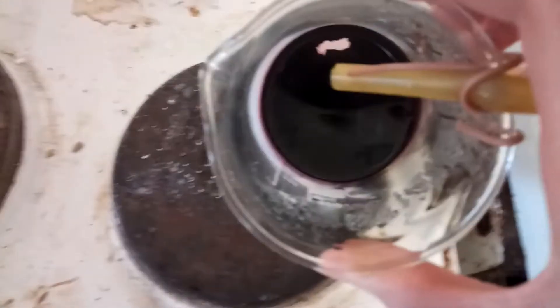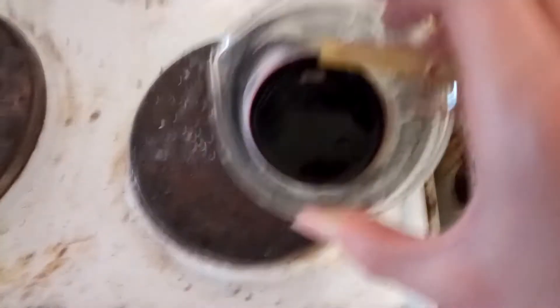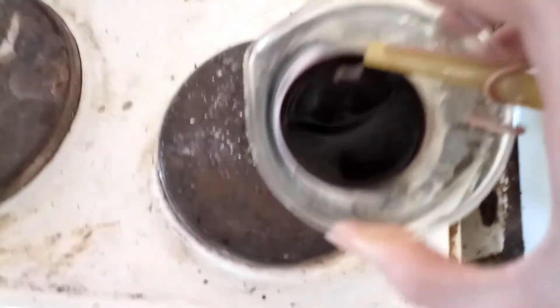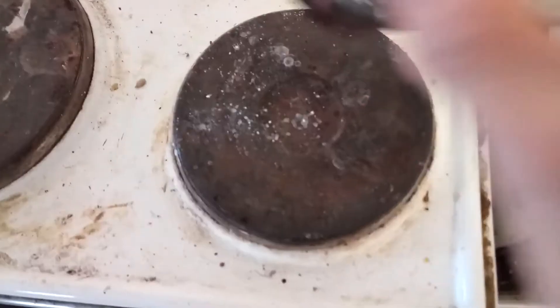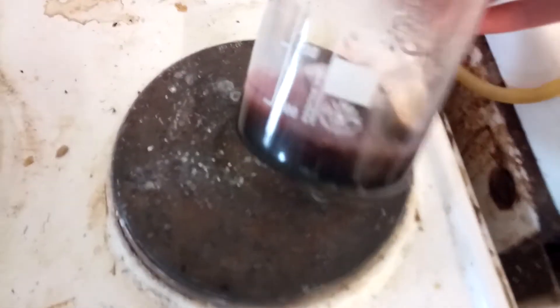It seems like we cooked that complex. This turned into what — copper oxide probably? All this black stuff in there. I guess I'm going to have to start all over again because I'm not going to get much yield out of that.